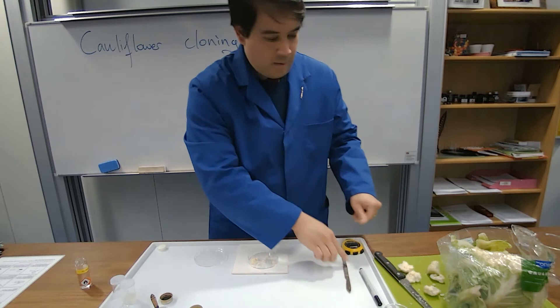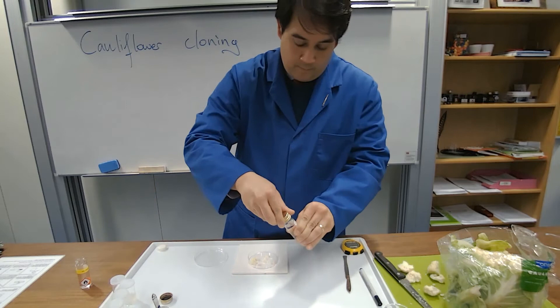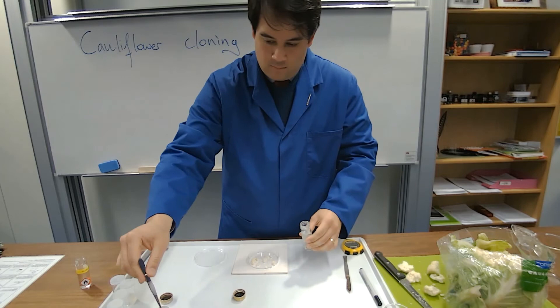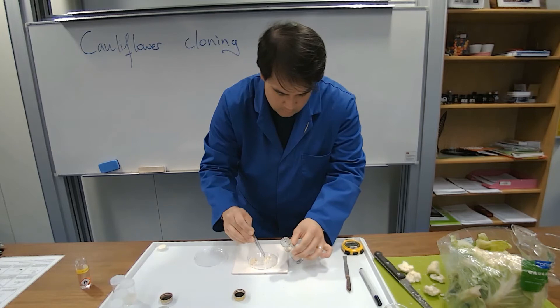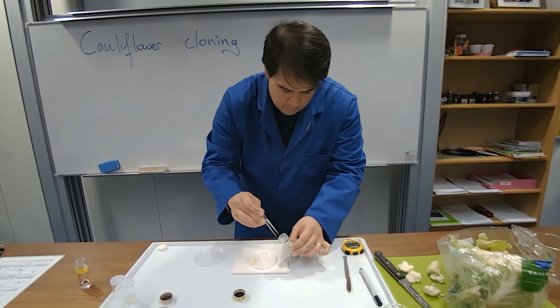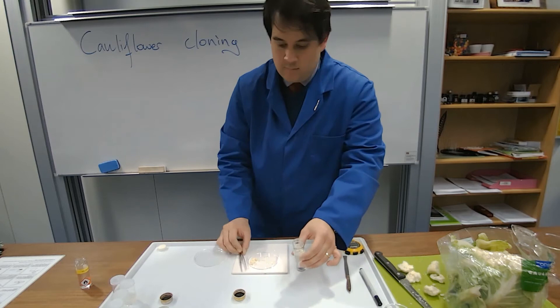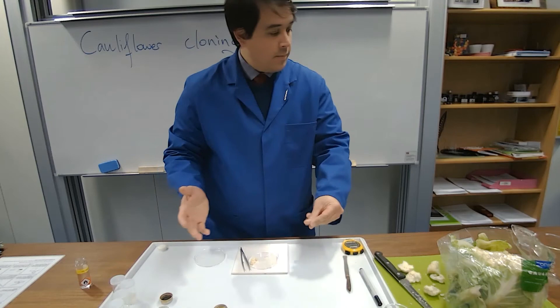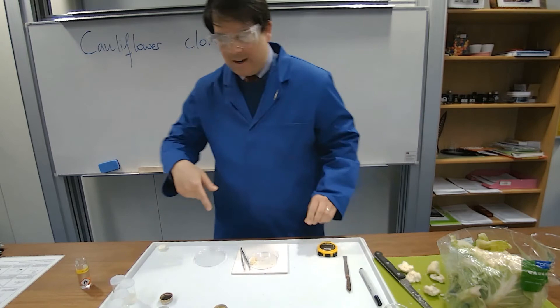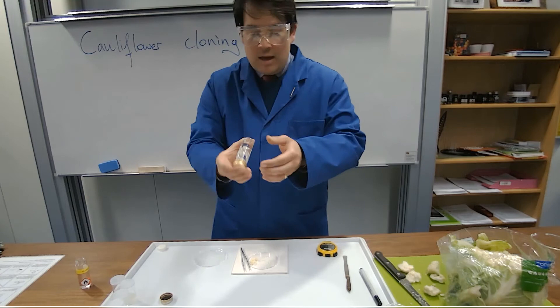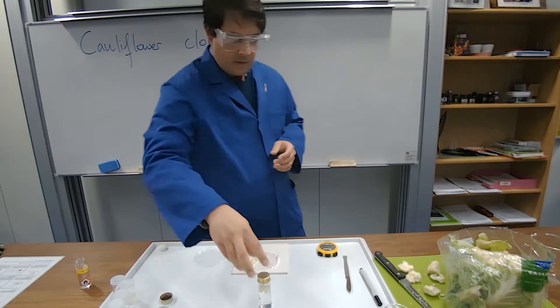Okay, I'll then take these now that my forceps are clean. Okay. Start the timer, gonna give this a swirl so then the disinfectant gets into all the bits and bobs as best as possible. Every couple of minutes, come back for a little swirl.